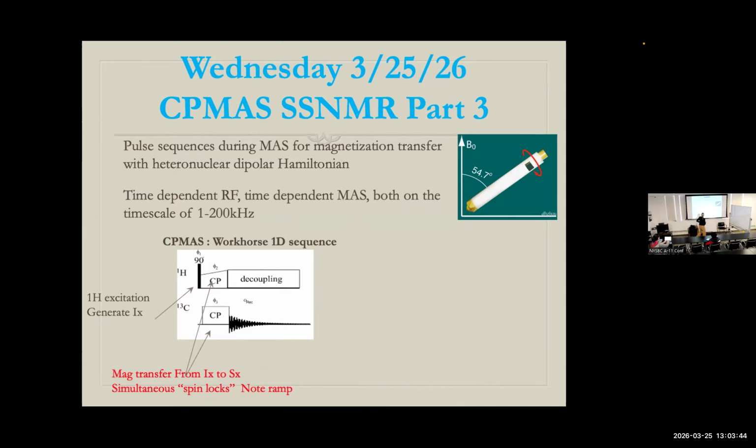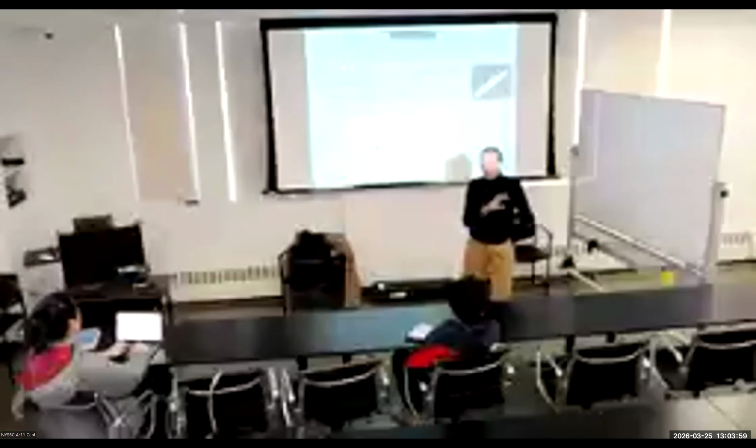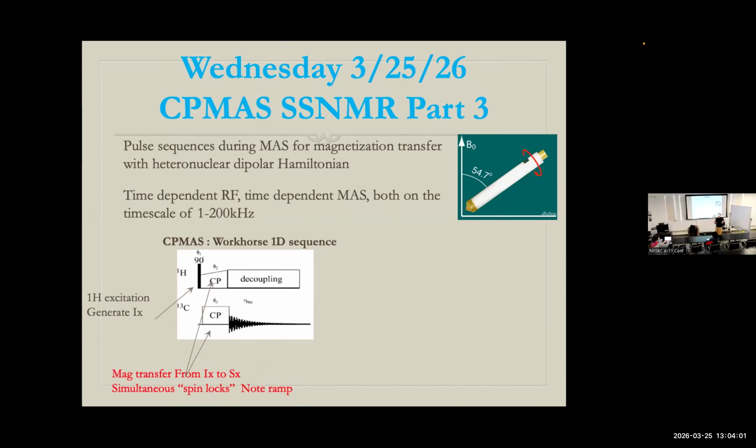That means, in practice, oftentimes one of those spin locks will be variable amplitude, and it could be a complicated function, it could be a simple function. But in the first analysis that I'll go through today, I'm pretending there's no ramp. I'm really simplifying this so we can just see how to apply Hamiltonian analysis when you have spatial variation, magic angle spinning, and spins, coupling elements, and the RF. How do you simplify this and really think about it?